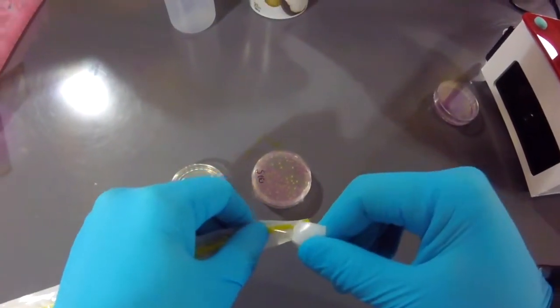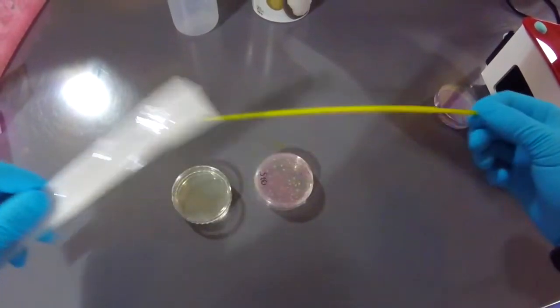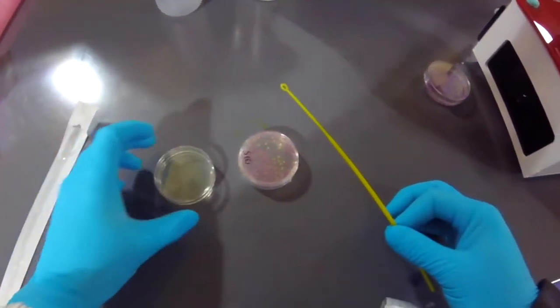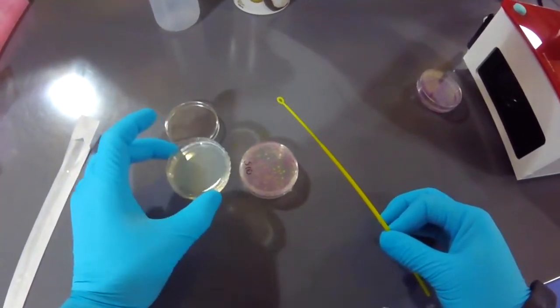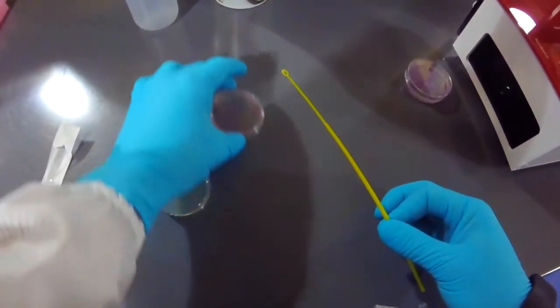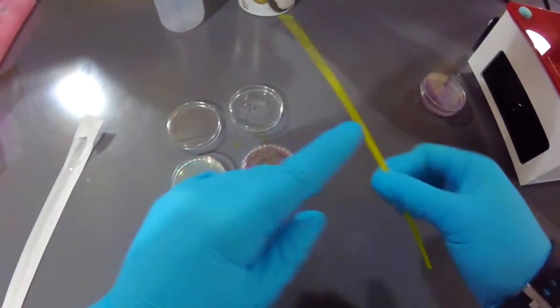So I'm going to open up my loop, pull out my loop here, I'm going to take my lid off of my plate that I'm going to streak, and I'm going to start with my source bacteria.